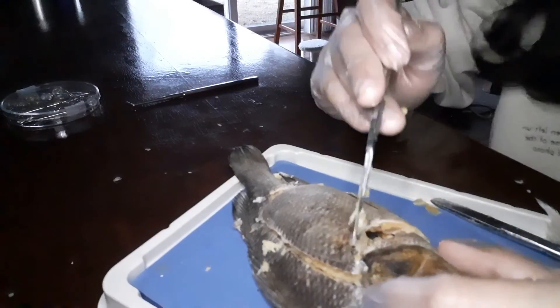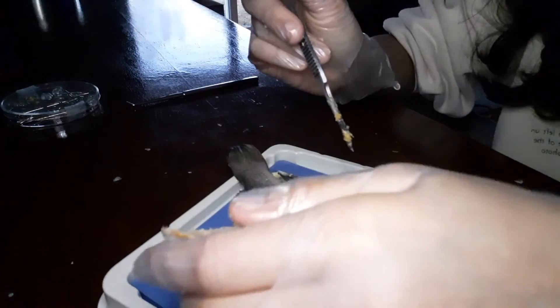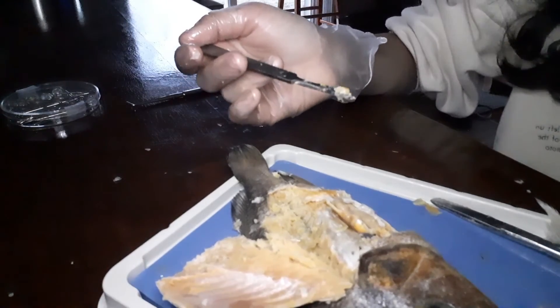Now that you've cut all sides of the fish, you can remove the flap and you should be left with something like this. Now let's zoom in and look at the inside body parts.